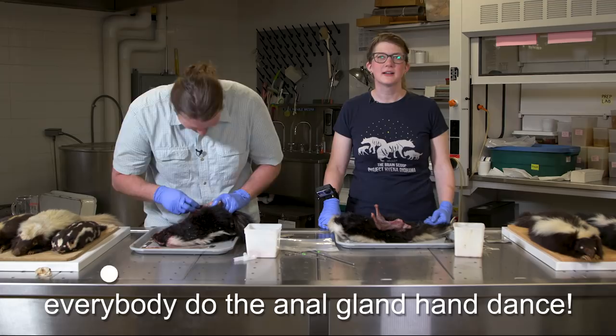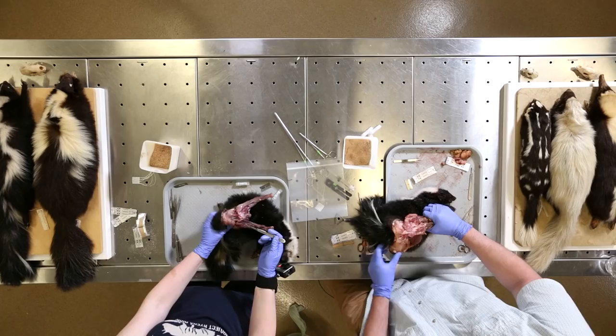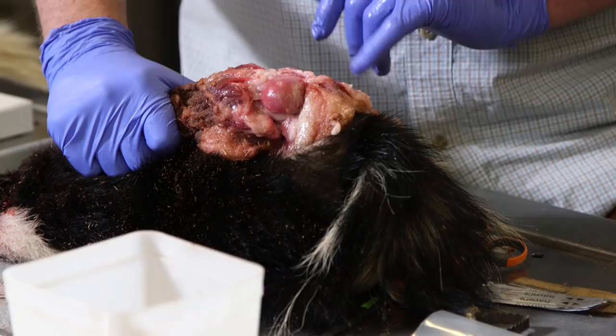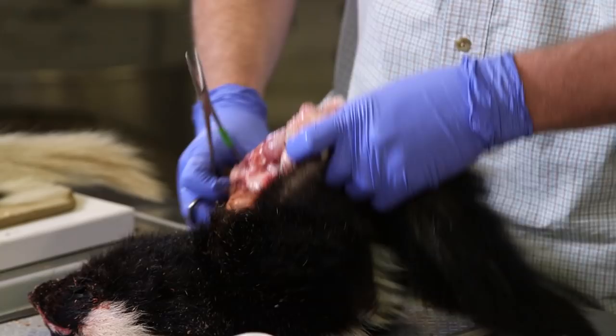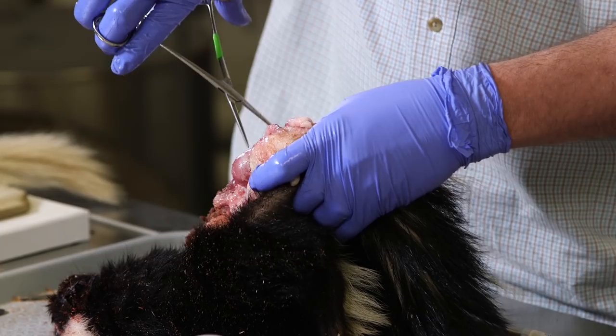Just to show you the size — I was saying ping-pong ball, which might be slightly exaggerated, but you can see the two anal glands. Now we've cut off some of the muscles. The next trick is to clamp with the hemostat and try to cut them off completely without cutting the nipples. Clamping the anal gland could be a follow-up verse to the song.